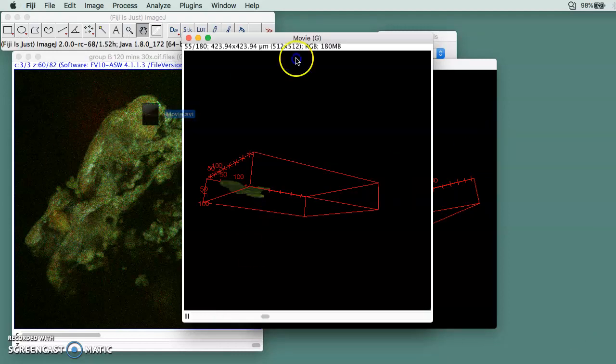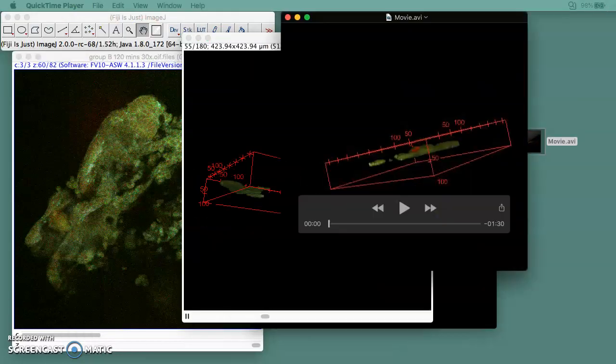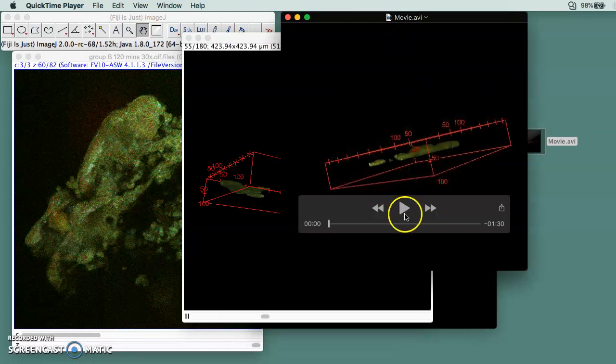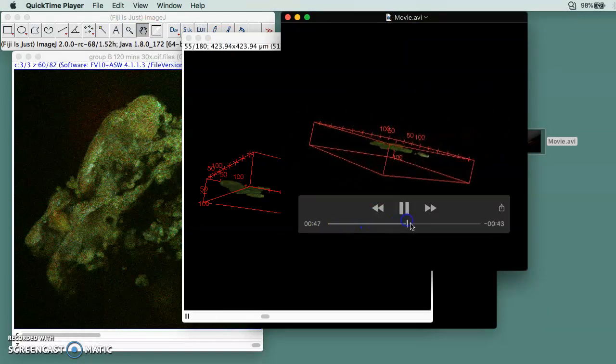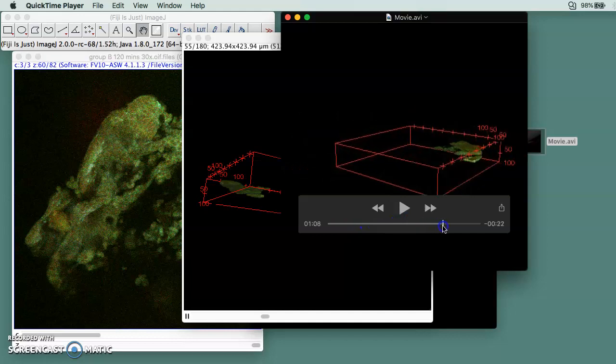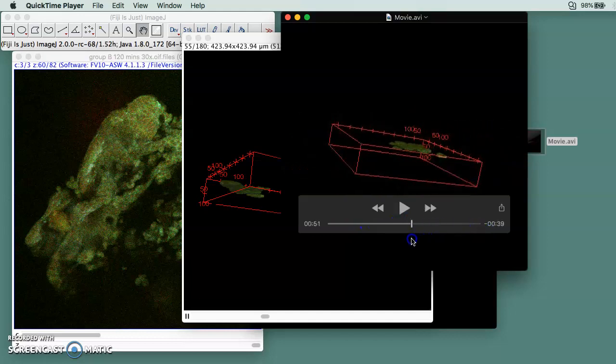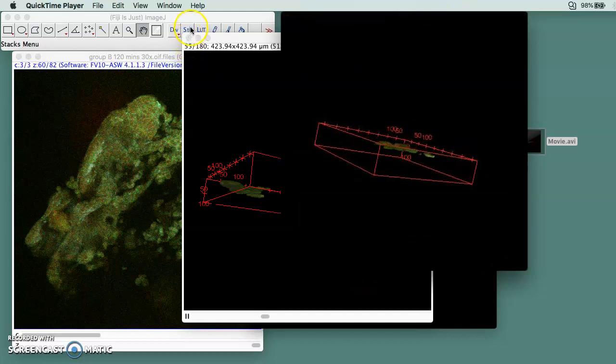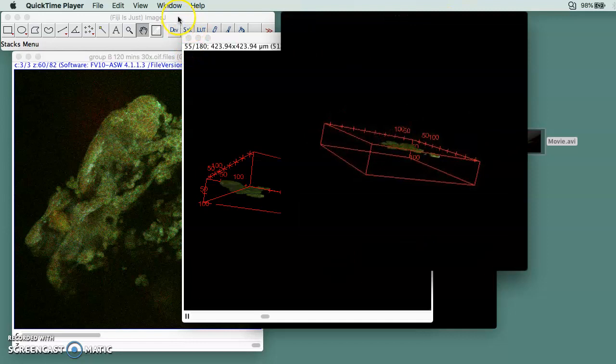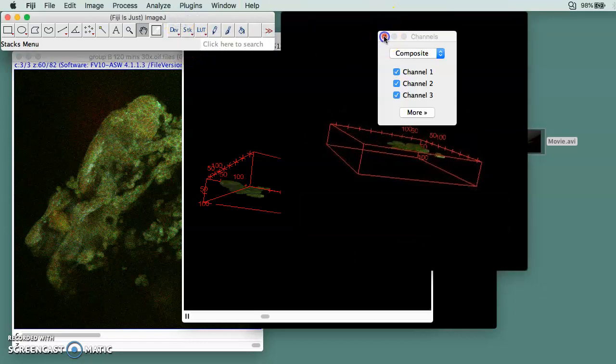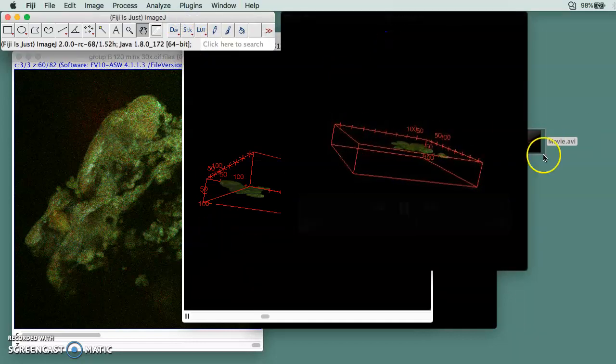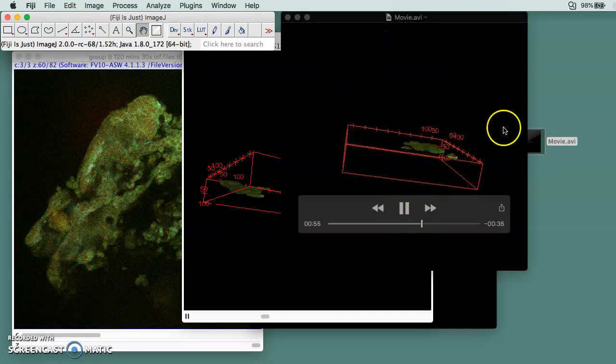Then you will have this movie. 7 frames per second is probably a little bit slow, but I think it's better than fast. So this is how you use Fiji to make a 3D image and make it into a video.